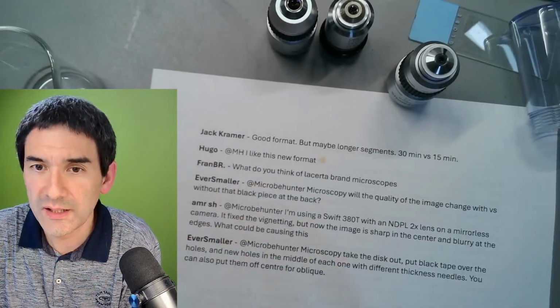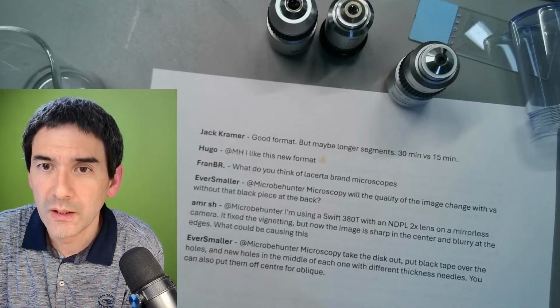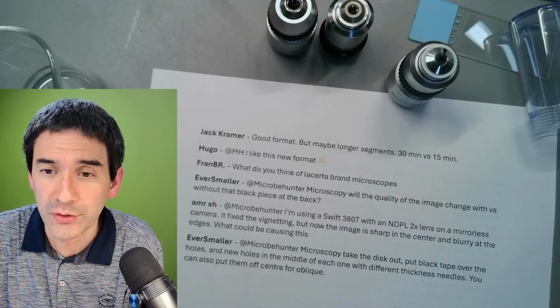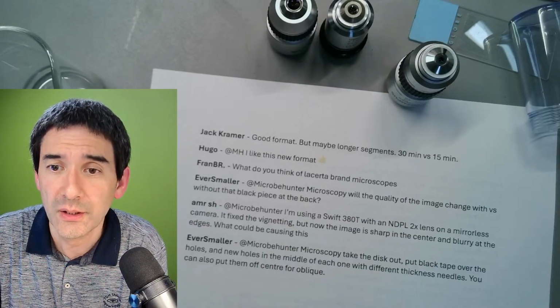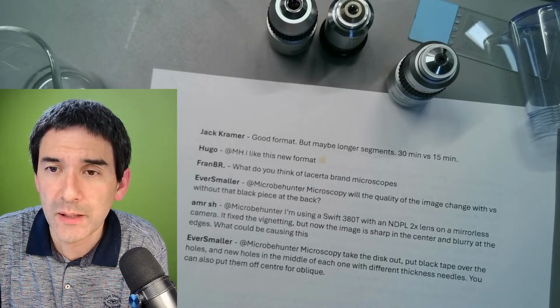Let me quickly see if there are any other comments for me. Would like to see vitamin C crystals and polarization again. Thank you for the recommendation. I have not done this for a couple of months now, but I'll pick up on that again. Okay, I've talked about this here. Polarizable, what happens if you put DIC back in place?